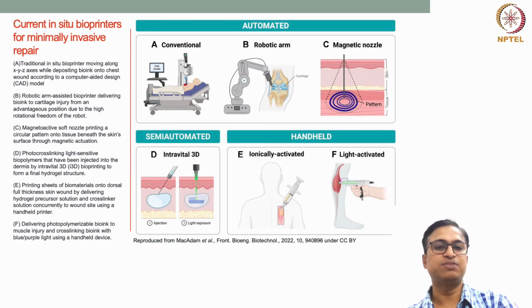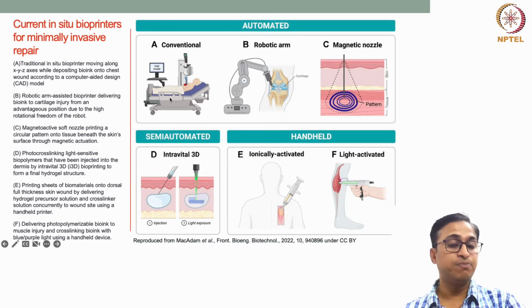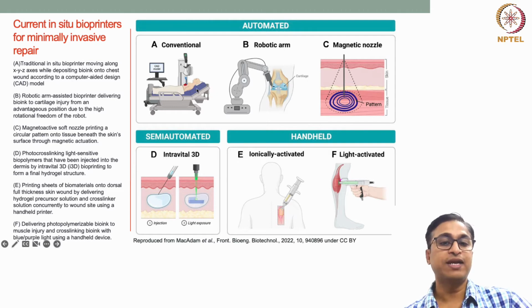Suppose the patient is lying on the surgical bed, and the computer and the bioprinter are also stationed within the surgery room, and then the bioprinting is done. This kind of thing is a very powerful technique to tackle many of the associated challenges I have mentioned earlier, and it also helps to heal the wound much faster.